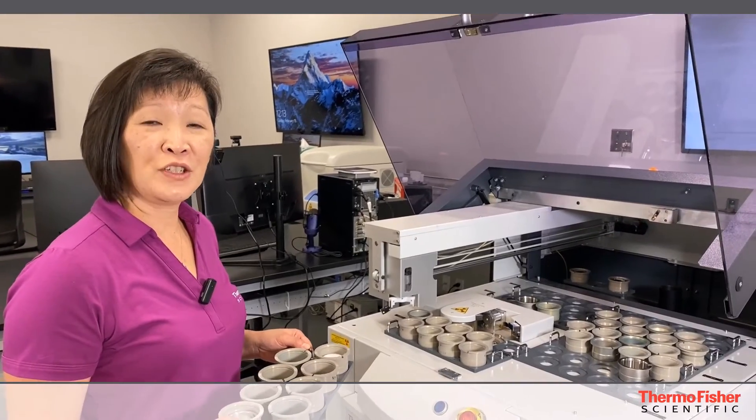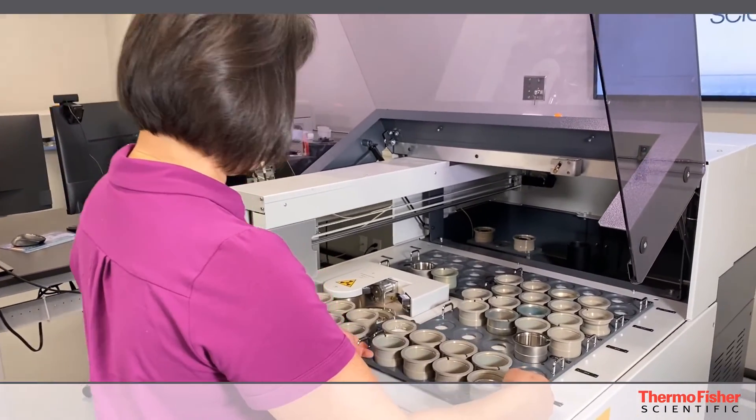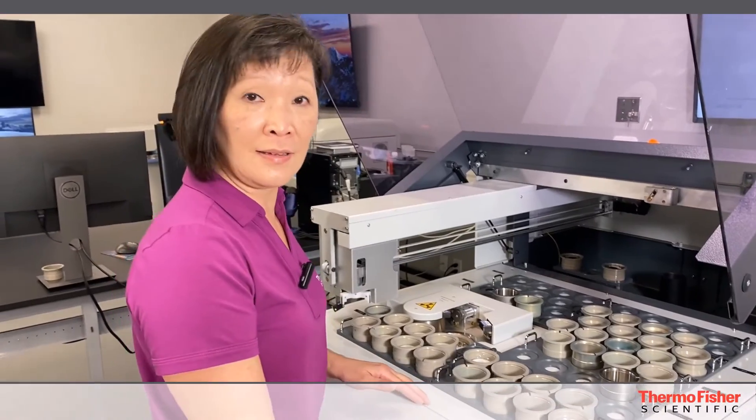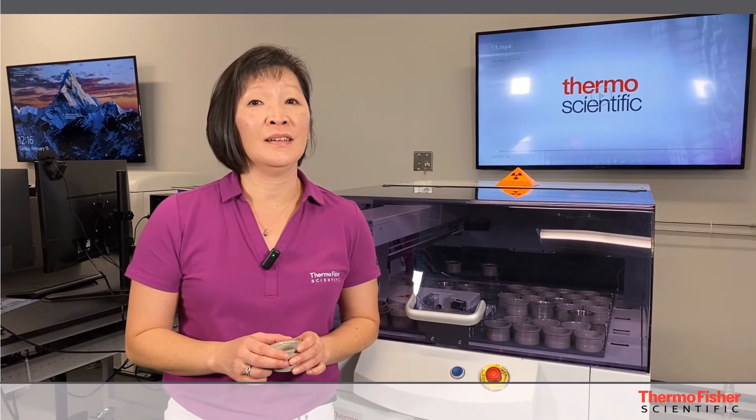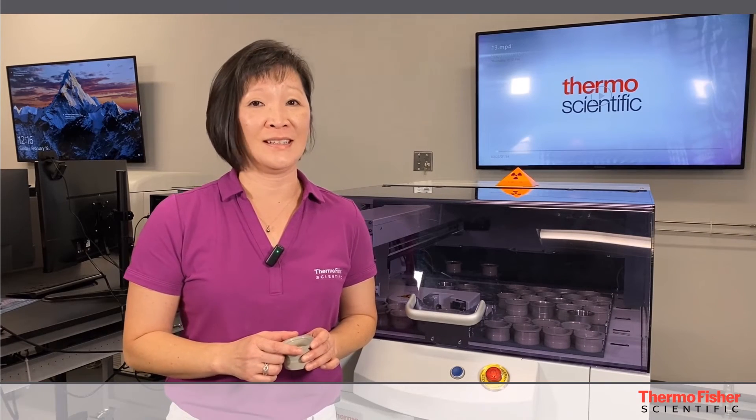All you have to do is load the sample onto the system, either by using the tray or manually. By using this simple trick with the cotton round, you should be able to run your loose powder sample under vacuum, and it will help out your sensitivity.